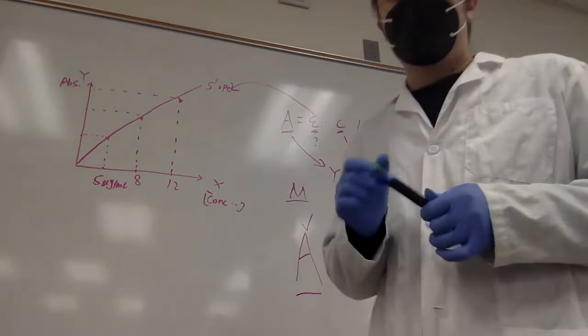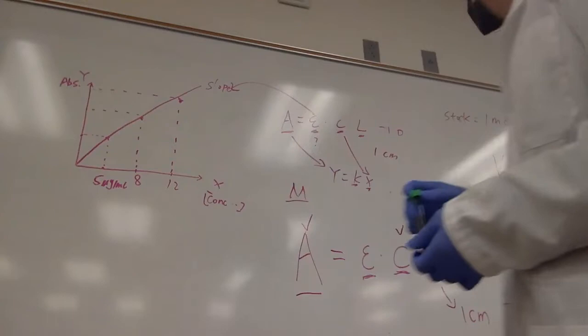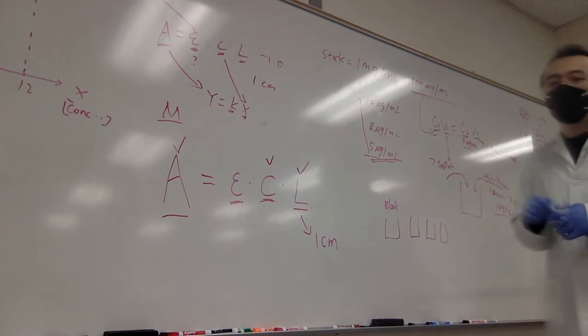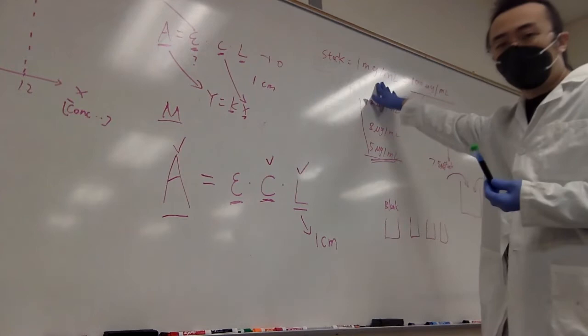Today the molecule we're going to examine is this one called stock A. The concentration, I'm not sure if you guys can see the whiteboard. The concentration for this stock in my hand is 1 mg/mL.